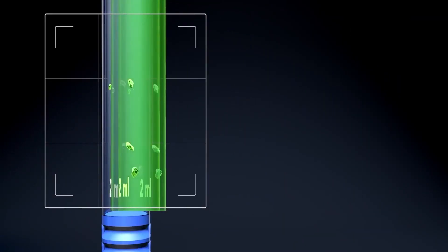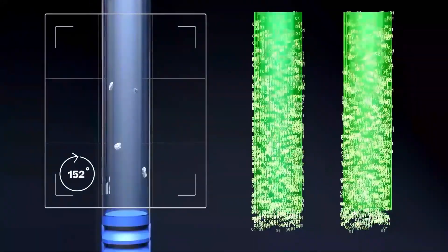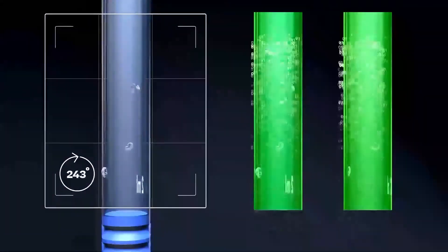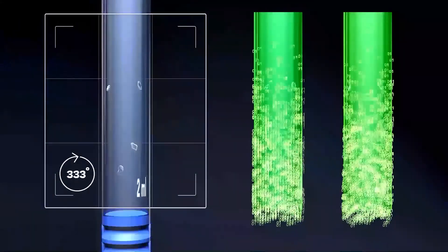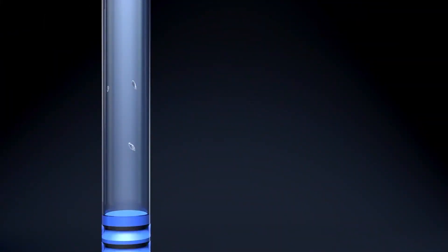This process is repeated until the entire circumference of the container has been inspected. In the final image, only unmasked particles are shown which have been identified by the process of elimination as being clearly located inside the container.